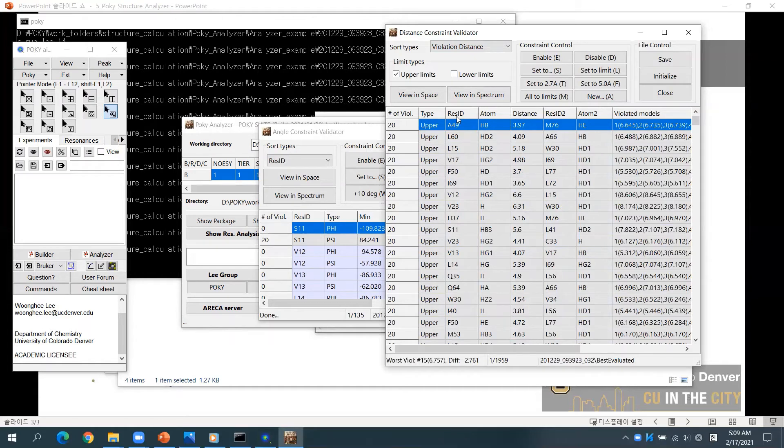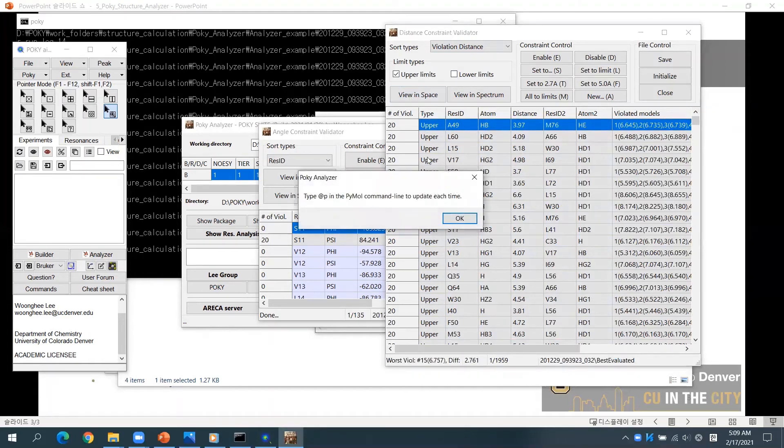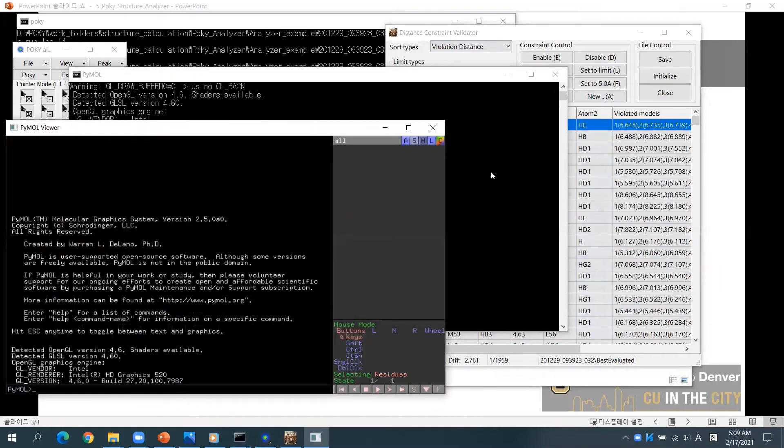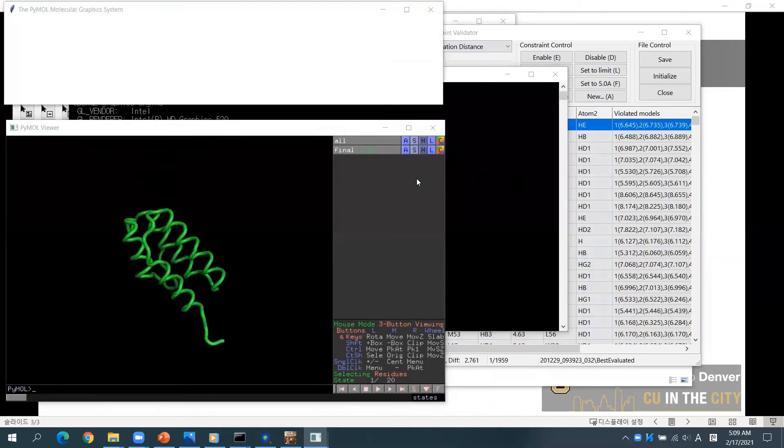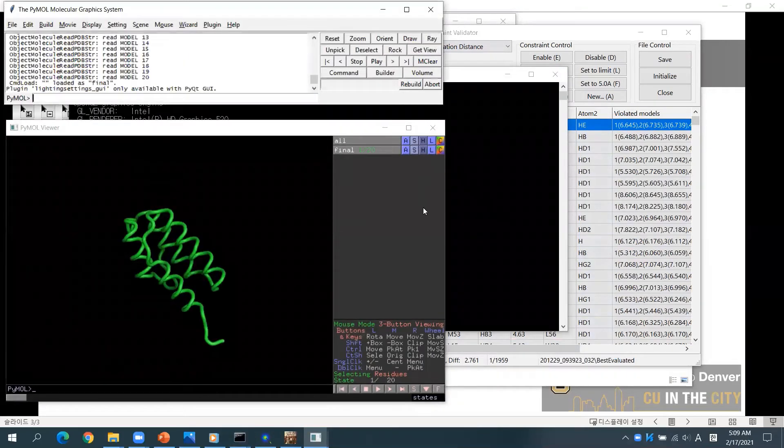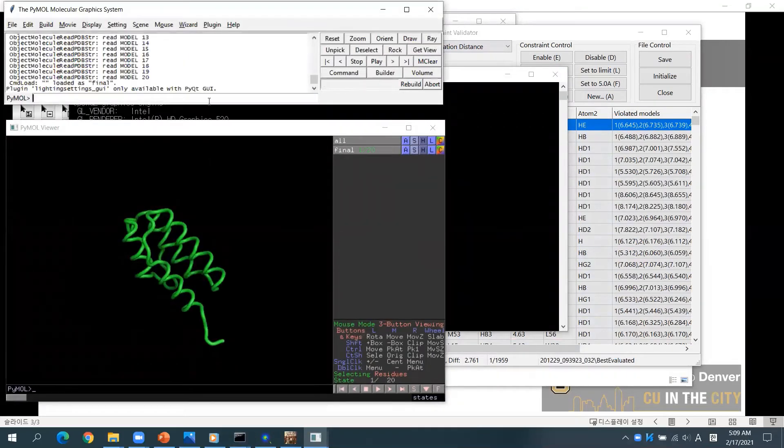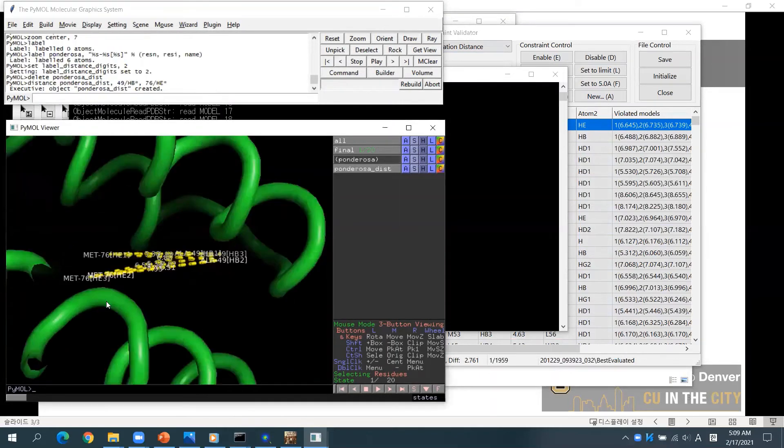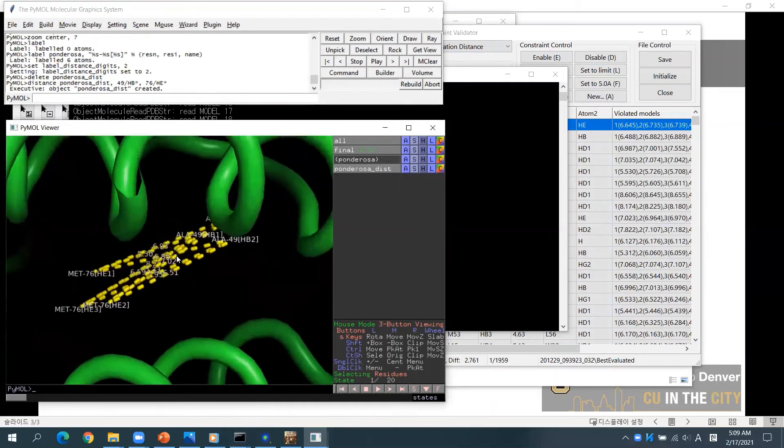Select one of the constraints and click Viewing Space. Type the command, then you will see the distances related to the selected constraint.